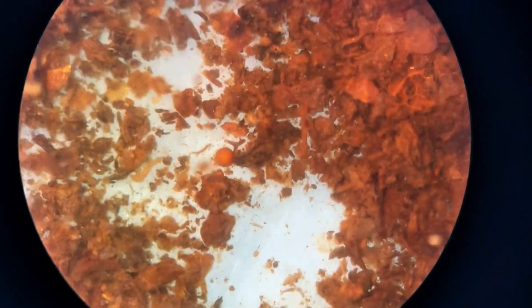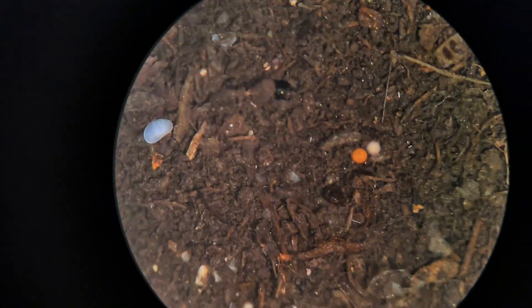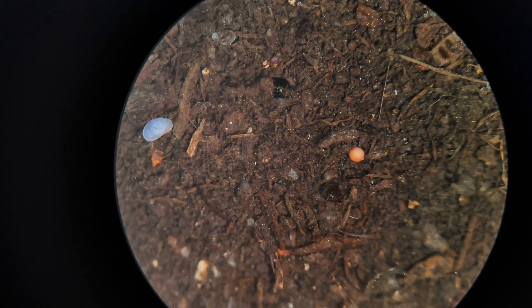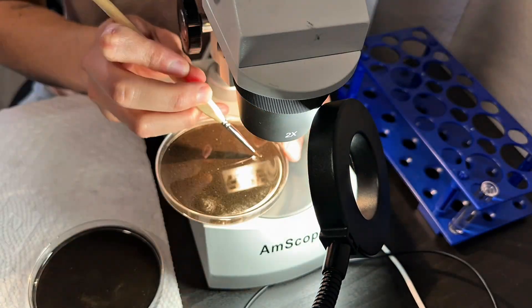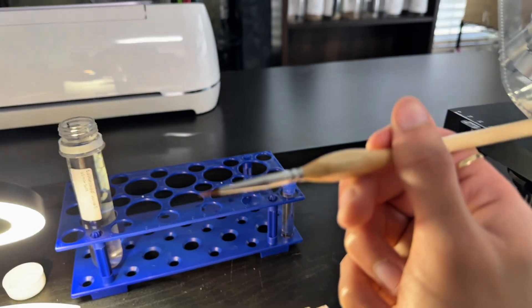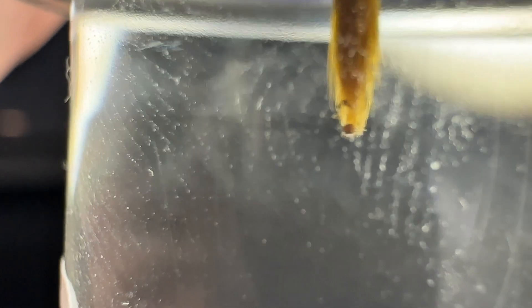These eggs are relatively easy to identify under the microscope due to their distinct coloration — typically yellow, orange, or brown — which contrasts well with darker soils. Using a fine-tipped brush, I carefully isolate the eggs and transfer them into a vial of water. Labeling is essential at this stage, so I make sure to document the species and the date that the eggs were collected.